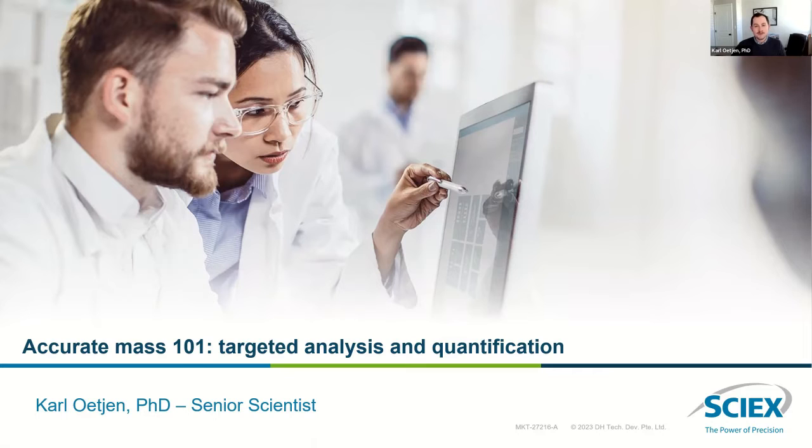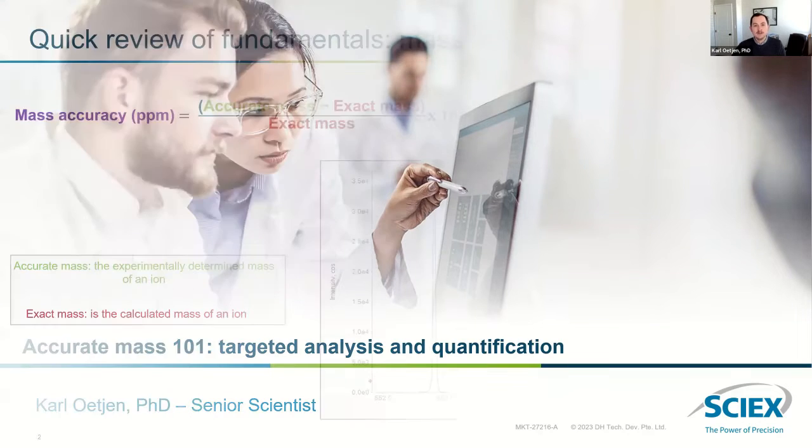Thanks everyone for joining for another session. Today we're going to be talking about using accurate mass for targeted analysis. That would include things like quantitation and also diving into the suspect screening world as well.